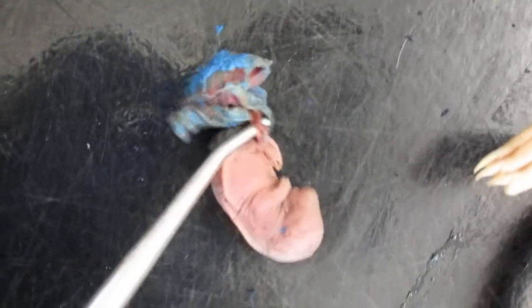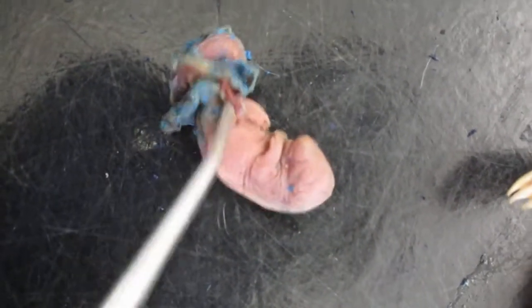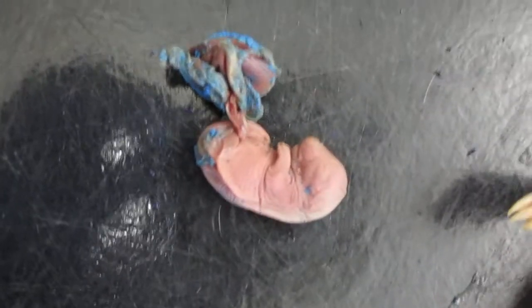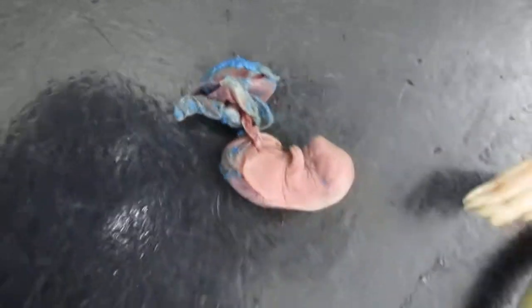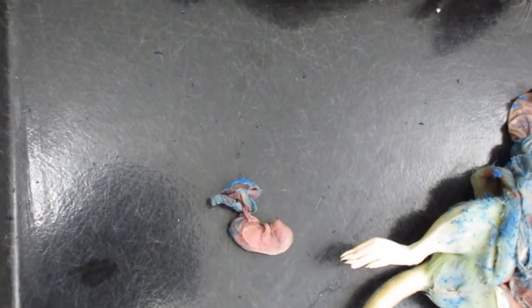Umbilical cord here. And placenta. Fetus, umbilical cord, placenta. And that is it of the endocrine and reproductive dissection.